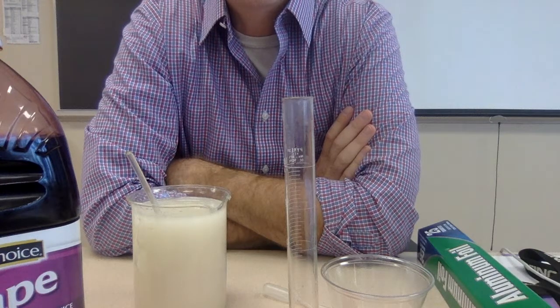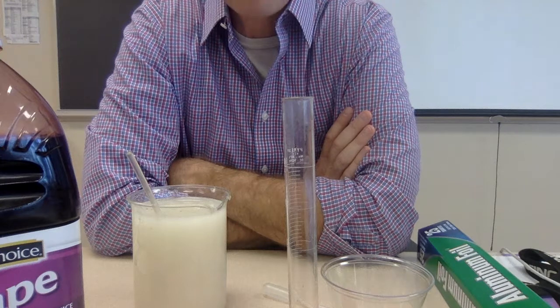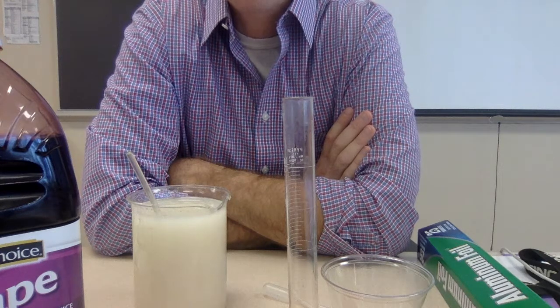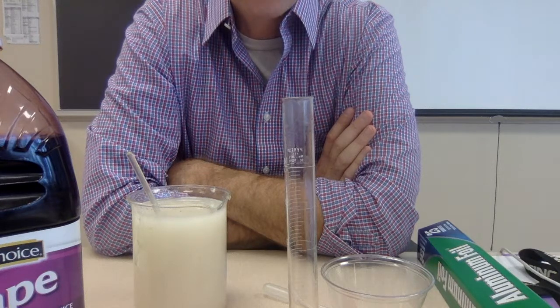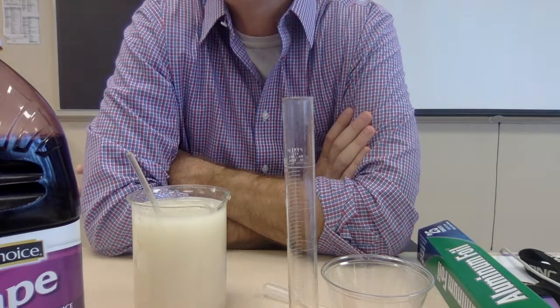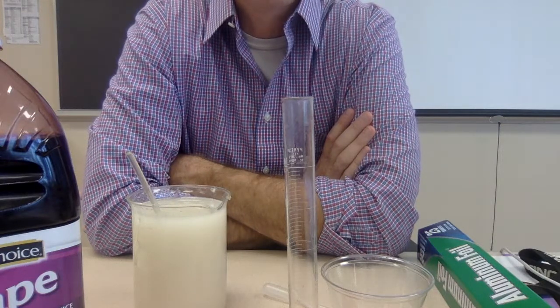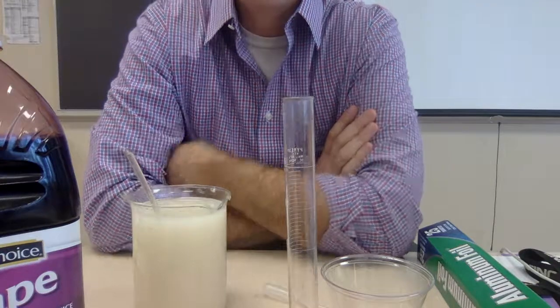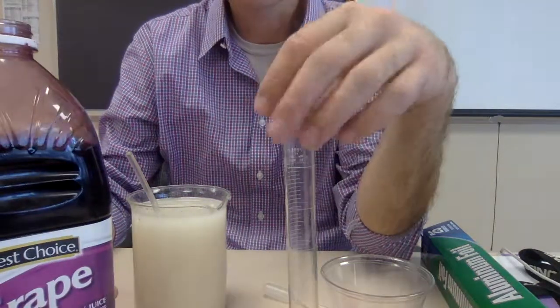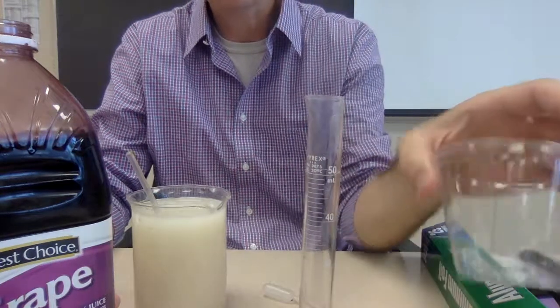Okay, so what you're going to do, the instructions for this lab are in Live Binders, chapter 4, and it'll say yeast lab directions. Okay, so I'm going to go through what you're going to do, but you need to look at the instructions as well. So it says to take 19 milliliters of the grape juice, and you're going to measure that in a graduated cylinder, and then you're going to put it in a plastic cup.